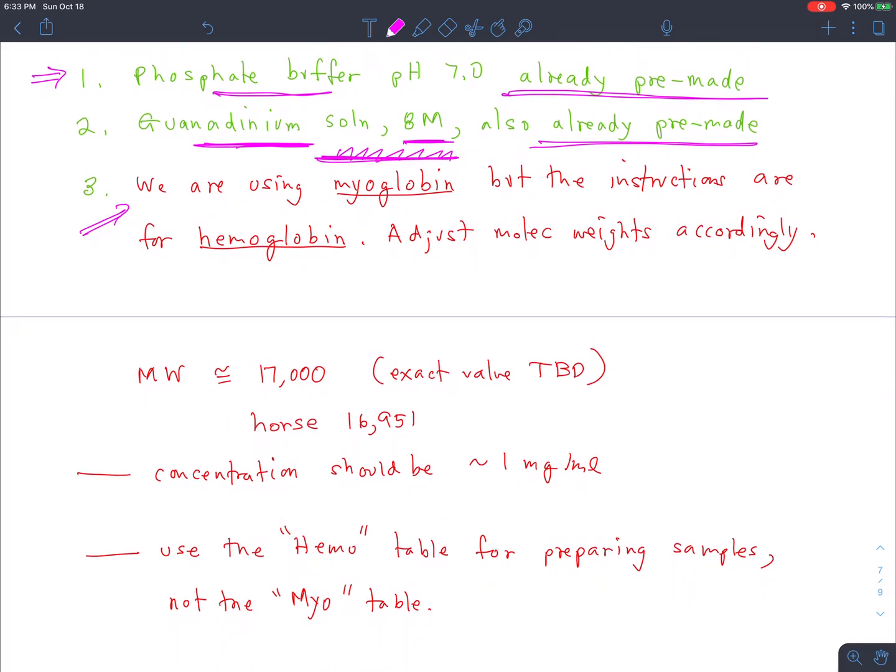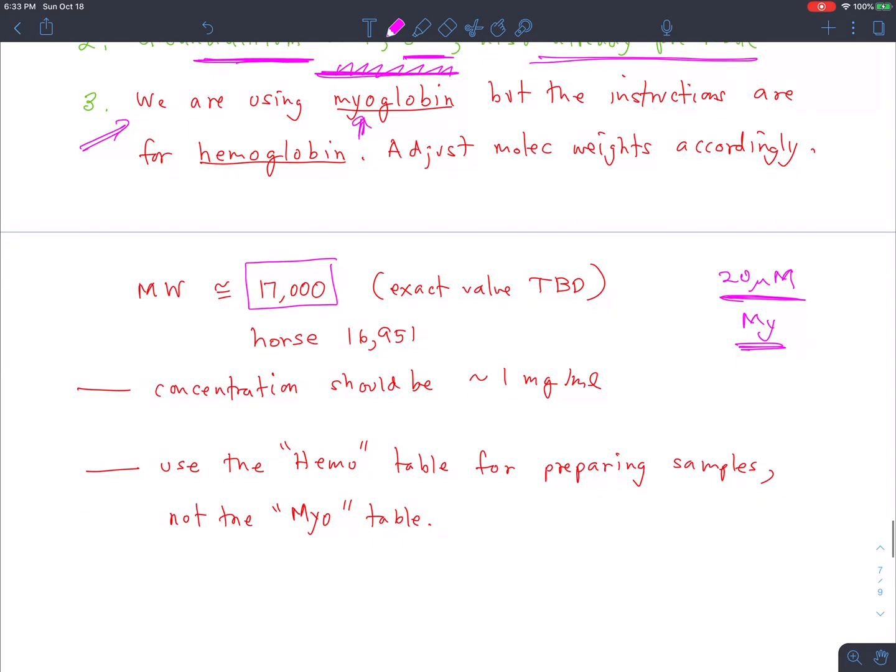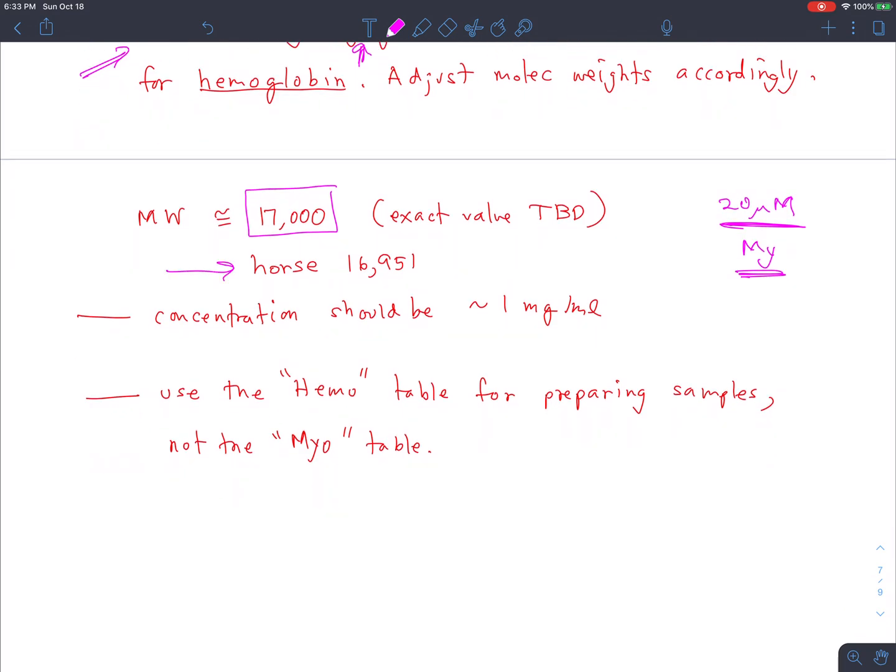The big thing about that is, since hemoglobin has 4 myoglobins, basically, I mean, they're not really myoglobins, but something like myoglobins inside them, it's got a molecular weight that's 4 times bigger than that of myoglobin. So if you're making a 20 micromolar stock solution of myoglobin, you have to put in a different weight of myoglobin because the molecular weight's different. For horse myoglobin, the molecular weight is 16,951. I think that's what we have, but I have to go check the bottle. I'm not entirely sure that's the exact molecular weight, but it doesn't matter. Molecular weight doesn't change that much from one species to another. It's around 17,000 for all species.